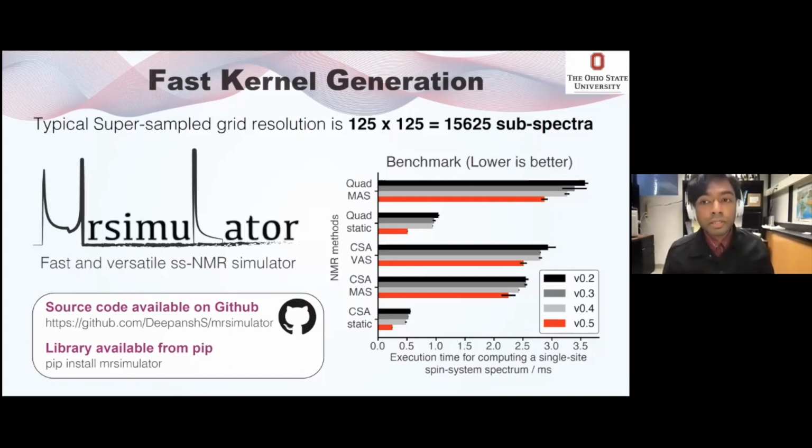You can do principal components, but then you make the problem harder, because now the principal components mix the isotropic and the anisotropic together. So instead of taking a 1D slice and inverting into a 2D spectrum, you're now going from an entire 2D spectrum to a 3D distribution. Mathematically it's the same, but one is a lot easier to implement than the other.